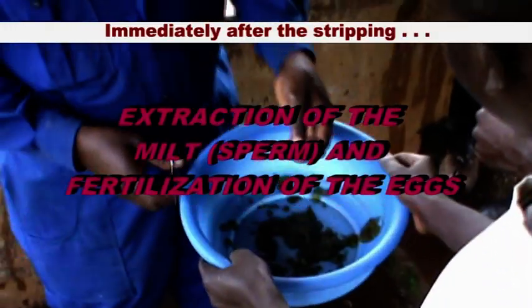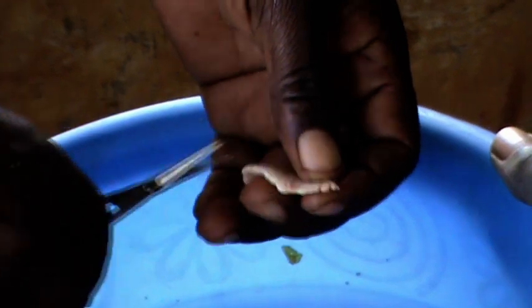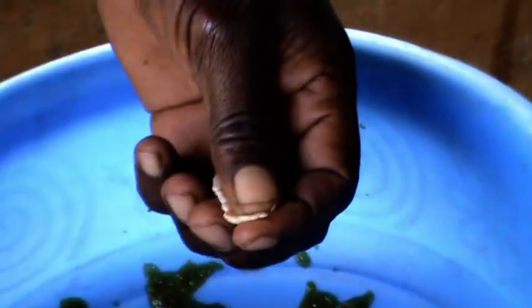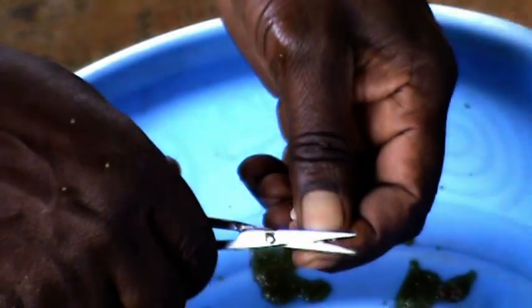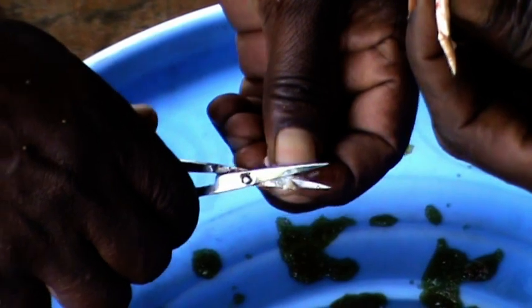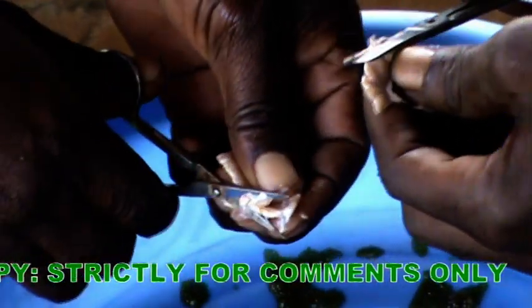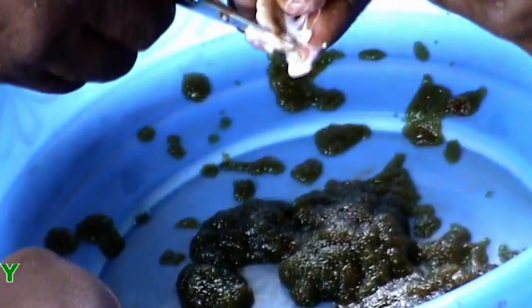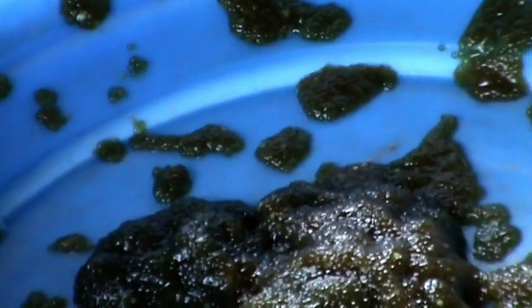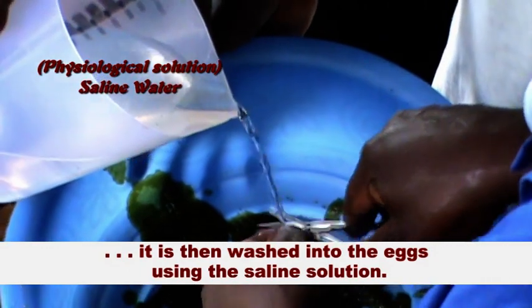Immediately after the stripping, the testes are rapidly cut into small pieces using a pair of scissors. After cutting and squeezing the milt out of the testes, it is then washed into the eggs using the saline solution.